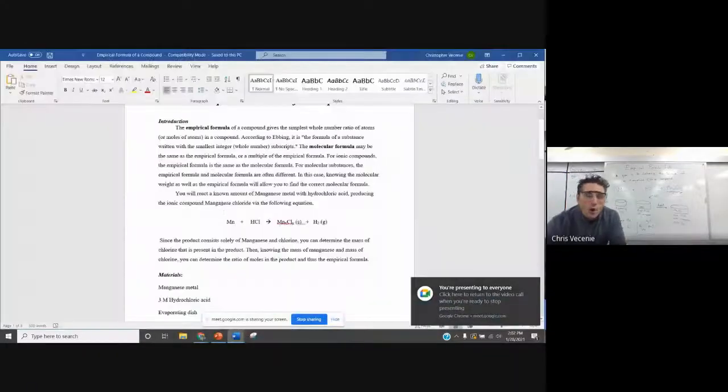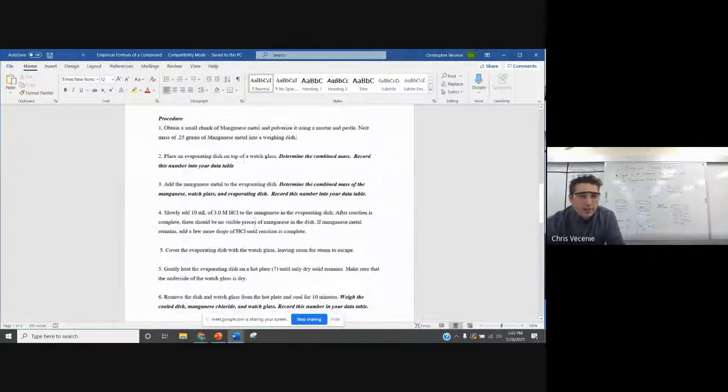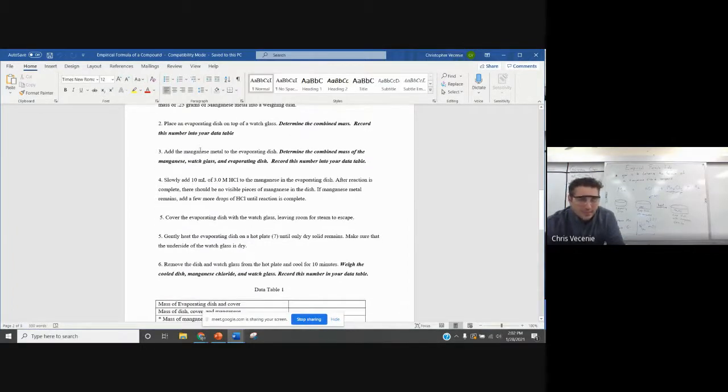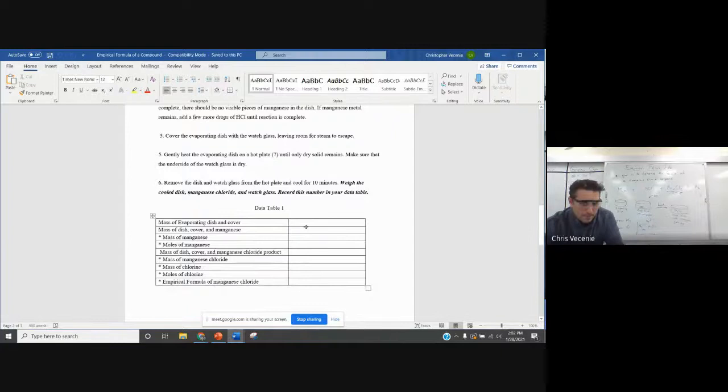All right. You just had me talk you through all of this stuff here. We're heading to the procedure. I'm going to go to the back. I'm going to get a chunk of manganese and break it up using a mortar and pestle to get about 0.25 grams. Then I'm going to get the mass of the empty crucible, or the empty evaporating dish, and put it in the data table. Then I'm going to put the manganese in, record it again, and put that in my table. So here's your data table that you will be filling in.